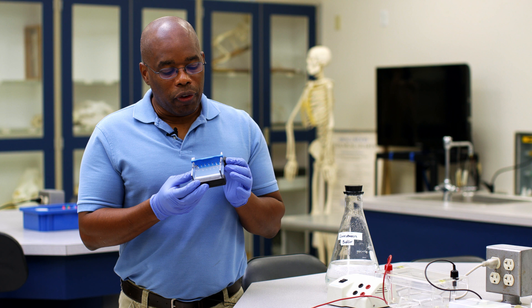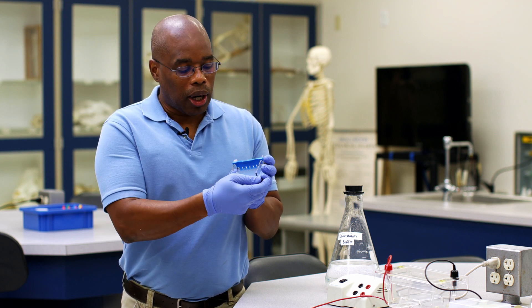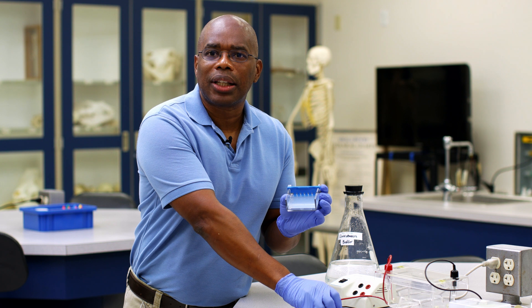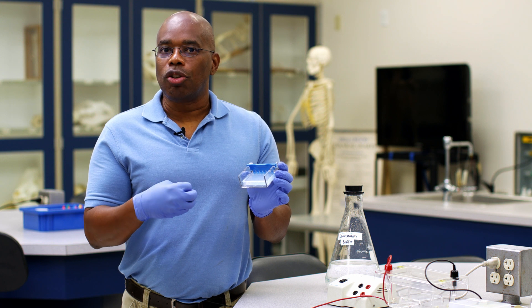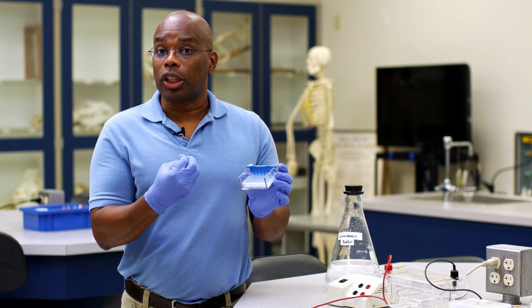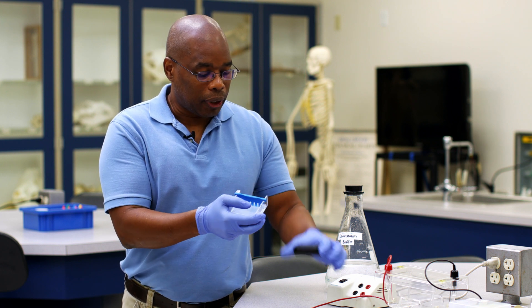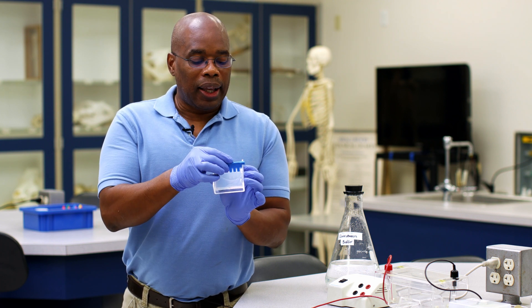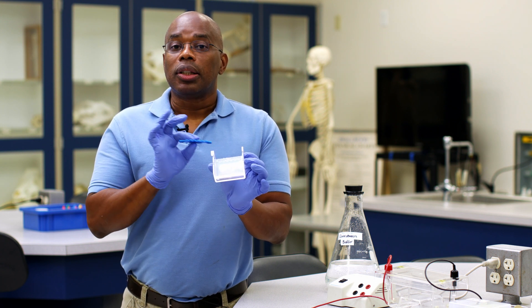To begin with, we first want to remove the black rubber dams from our gel. These rubber dams are only used because the gel is like jello — it starts off as a powder, you put it in water, you boil it, and then you put it in a mold and allow it to cool. This is our mold, and the dam allows us to do that. Next, we want to remove the comb, which allows us to position the wells in the gel where our samples are going to be loaded.